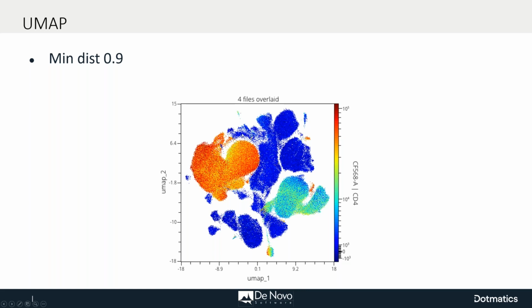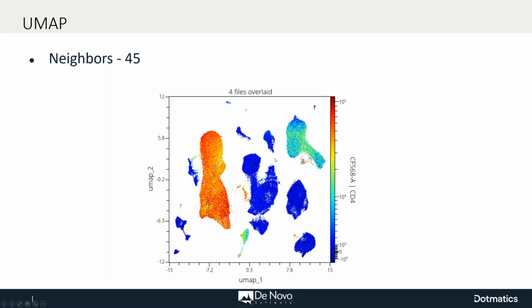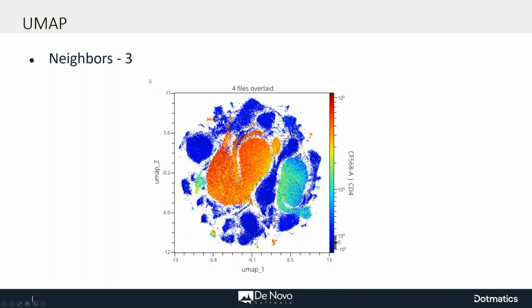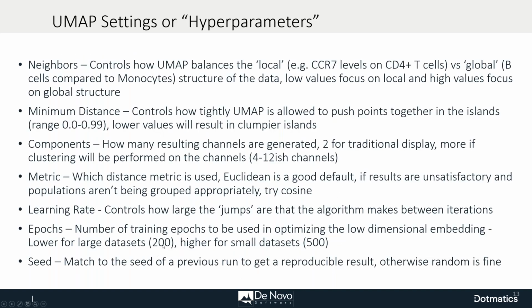And so this is just something to keep in mind, that if your first result out of UMAP doesn't really look like it's cleanly separated, or it's kind of a confusing result, feel free to rerun either the UMAP with these different settings or with a different seed. And this is something I want to touch on just really quickly, because sometimes I get this question from people.